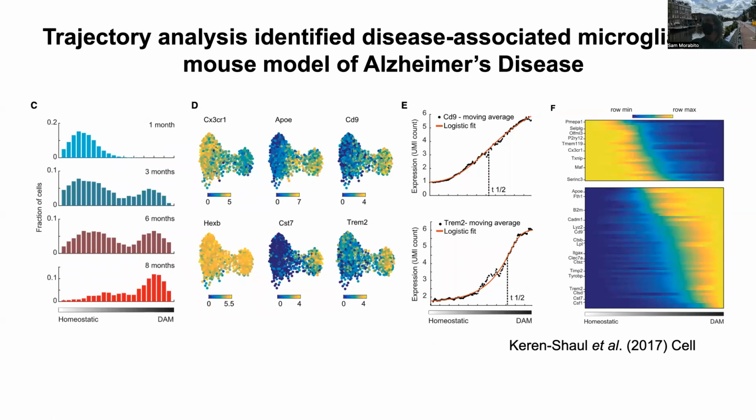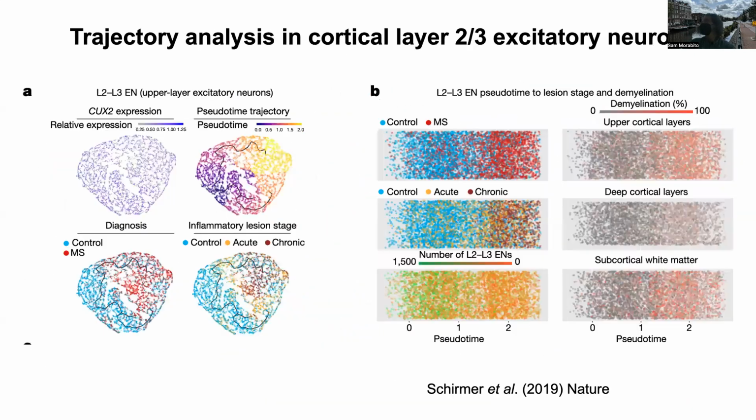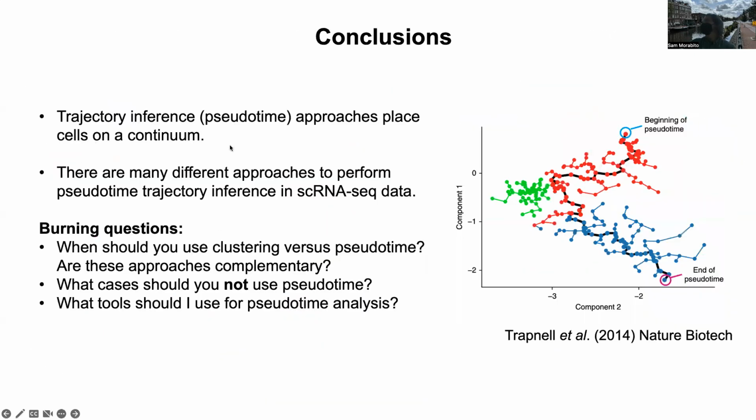So that would be something you could do with pseudotime that you might not be able to do with clustering. But yeah, this is the same as my opening: what is pseudotime and how is it different than clustering? I hopefully covered a lot of these things, but this is a pretty big topic, and ultimately I think it's complementary to clustering, but not necessary in many cases. If you have a developmental data set, you should definitely do it.